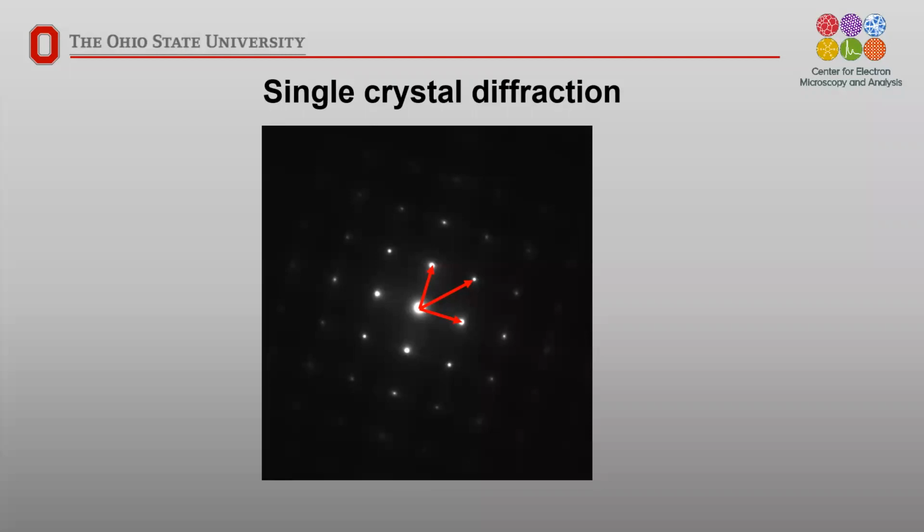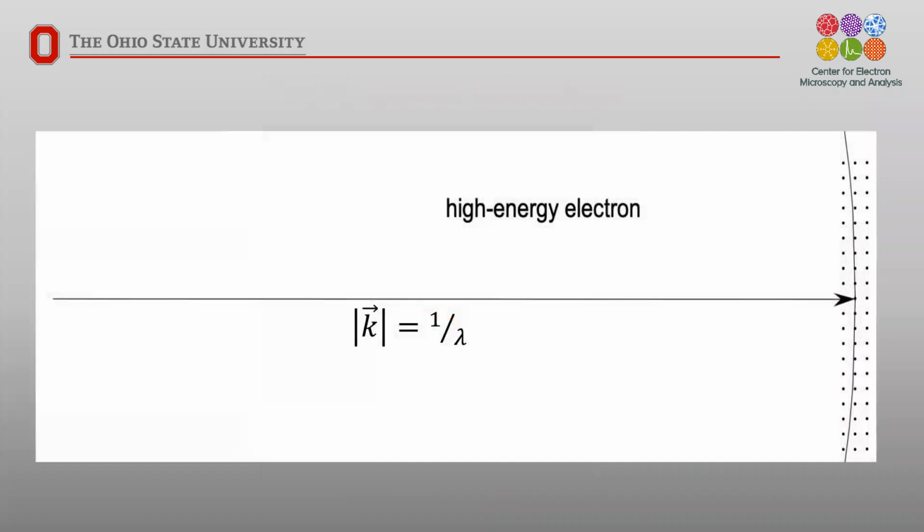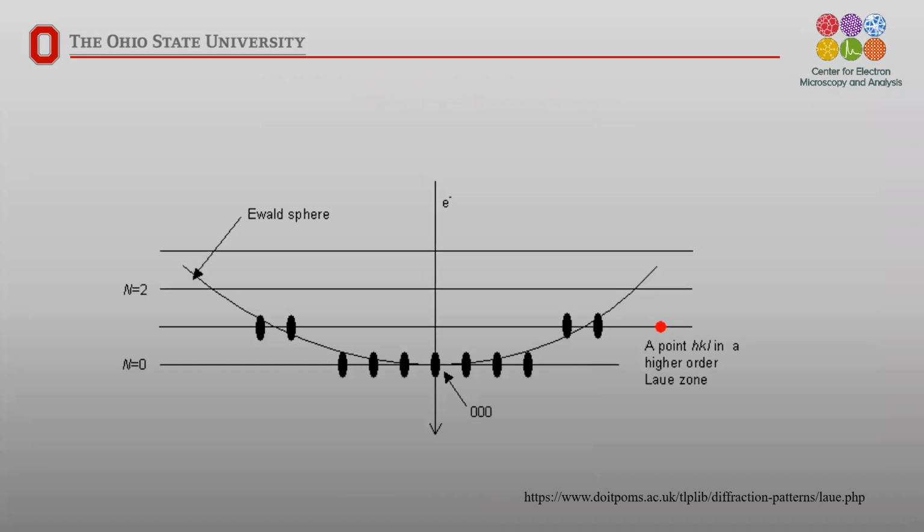But let's take a look at this Ewald sphere again. I said it is almost flat, but not completely. There is curvature to it. And if you look, you can see that it curves out as we move farther and farther away from the origin. So if I give a schematic of this very exaggerated curvature, what you have is a reciprocal lattice that reflects the real space atomic arrangement. But as the Ewald sphere curves, it will intersect reciprocal lattice points at a different level. And remember, when the Ewald sphere intersects a reciprocal lattice point, we will see diffraction taking place. We meet the Bragg condition.